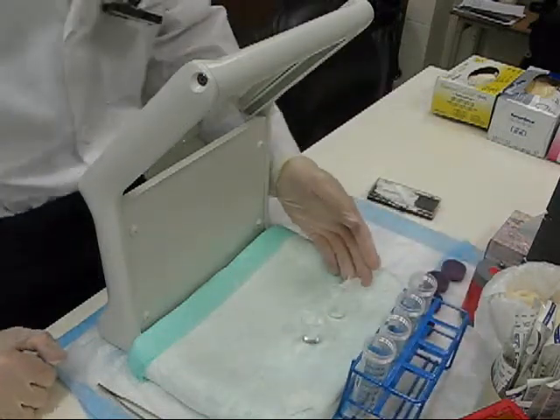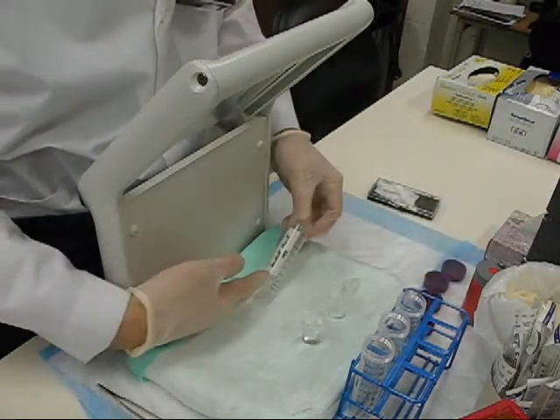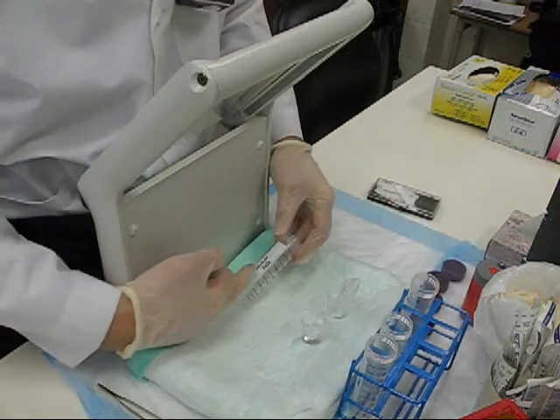On the left I have my MEK, on the right I have my saline. My container is Solvent Front MEK on the left, and Origin MEK on the right.